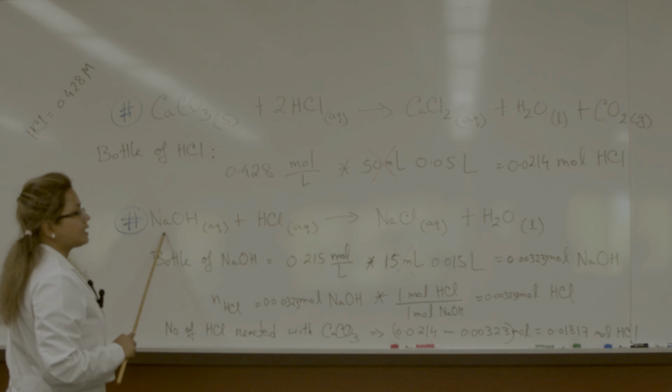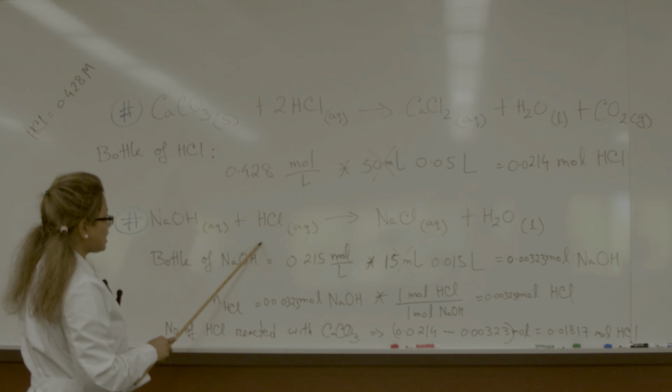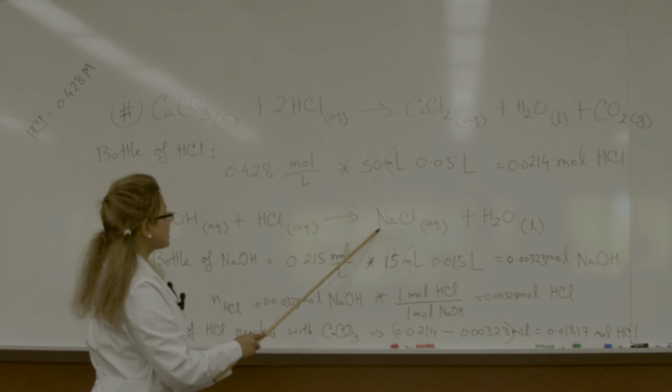Now, the next part is the titration. Sodium hydroxide reacts with hydrochloric acid and produces sodium chloride and water.